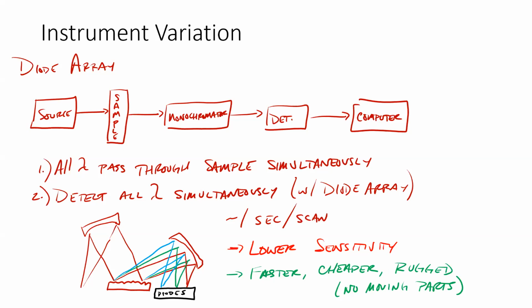You're not going to find a whole lot of people who take a mass spec out to the river. But they do make these little UV vises that we've used. They do make an IR that's meant to take out to a crime scene or something, so you can have pretty fast analysis. But anyway, when we talk about ruggedness, we're talking about how easy it is to transport, how easy it is to take out with you, and still operate at the expected level.